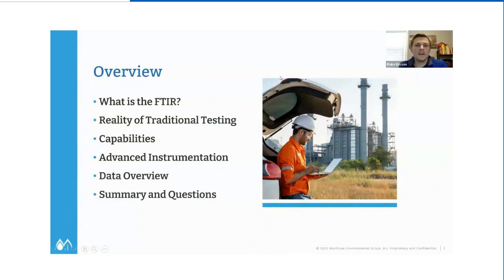So, getting into it, what we're going to do today is talk a little bit about what the FTIR is and how it can help you with your processes. A lot of what we're going to be talking about revolves around stack testing and performance testing. But I do want to reiterate that the FTIR is a multi-purpose tool and it can be used for a lot of things, including process gas optimization and a whole slew of other things. We'll get into that more. So it's not just a stack testing instrument; it can be used in a lot of applications.